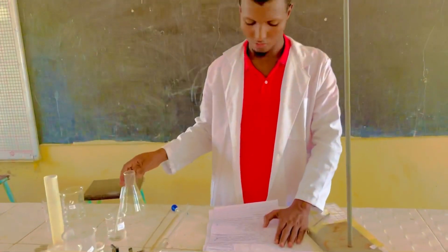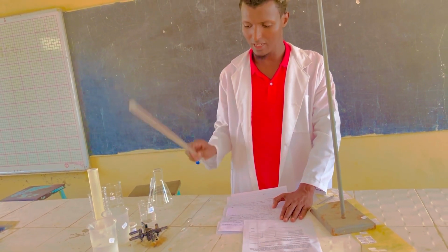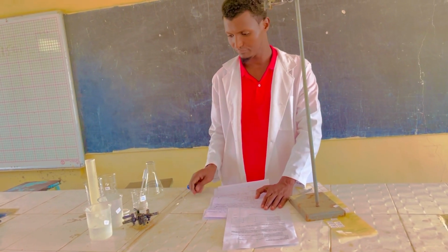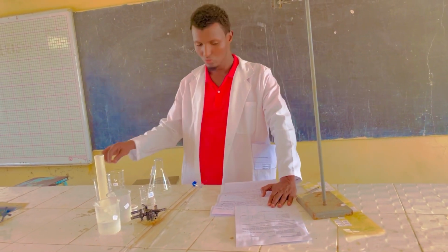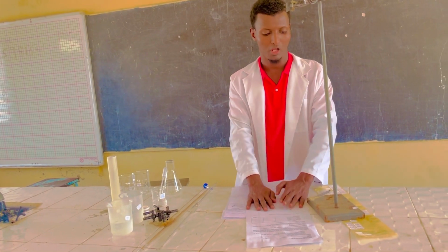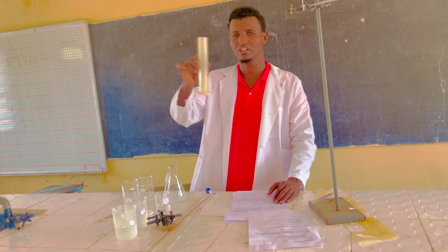We also have a conical flask, a burette of 50 ml, and a pipette of 25 ml. We have 2 empty beakers, a label, and a 100 cm³ measuring cylinder.